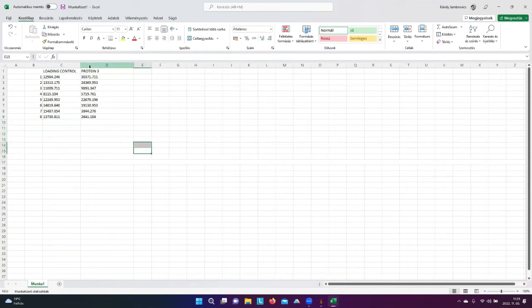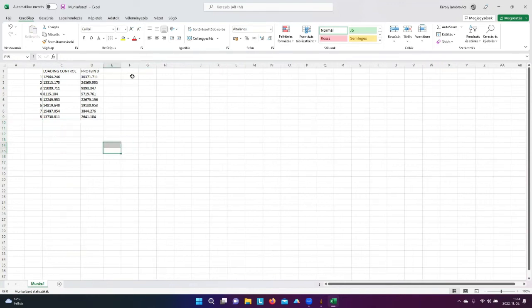And the mechanism, or the analysis, how can I say, the strategy. In most Western blot analysis, we need to divide the protein expression by the loading control. So I'm going to do the same thing. I'm going to use the protein values, and I'm going to divide them by the loading control ones.